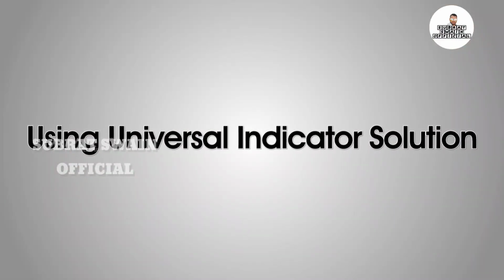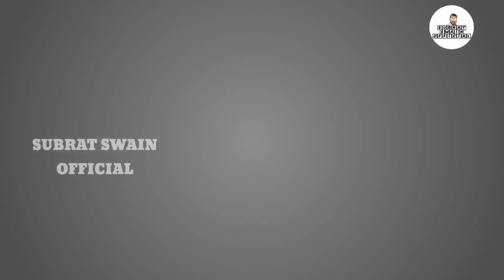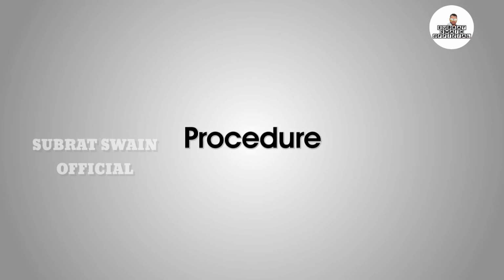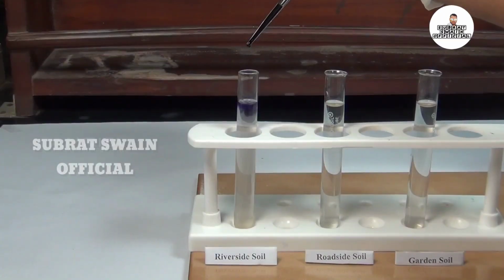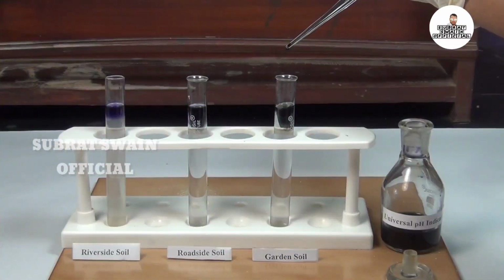Using universal indicator solution. Materials required: soil solutions, dropper and universal pH indicator solution. Procedure: using a dropper, take some universal indicator solution. Put some indicator solution into the test tube that contains soil sample.